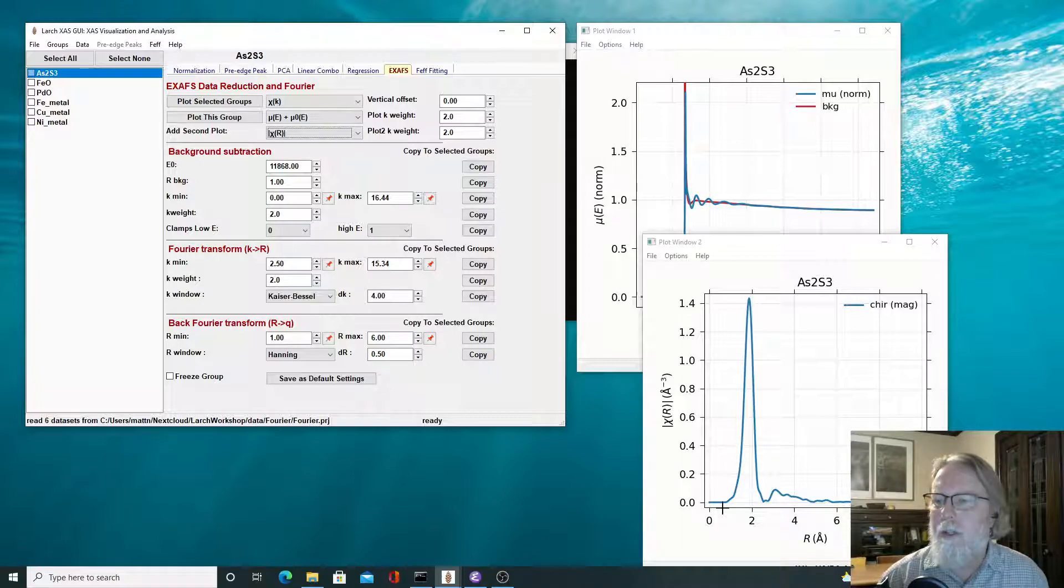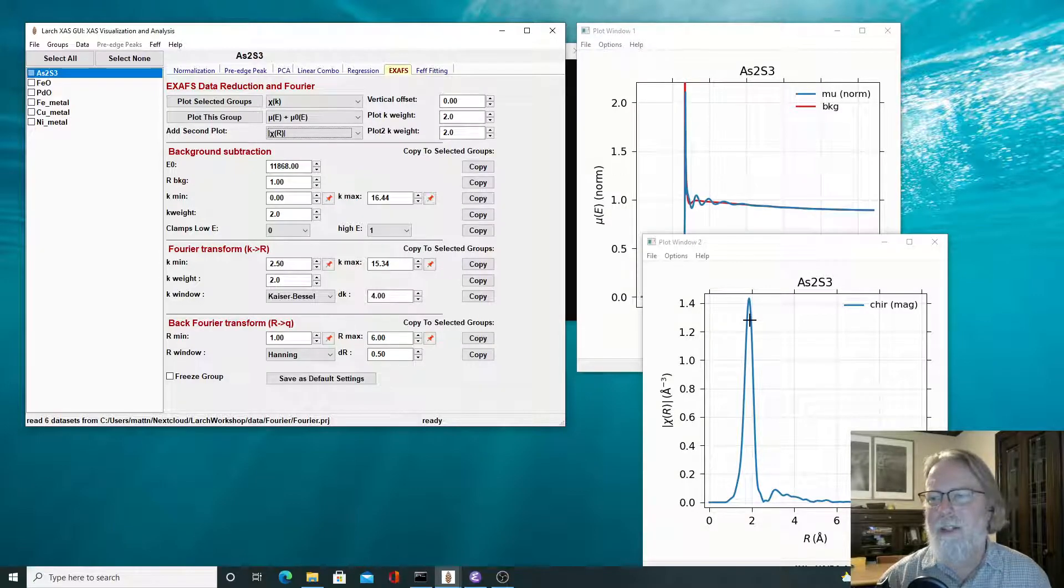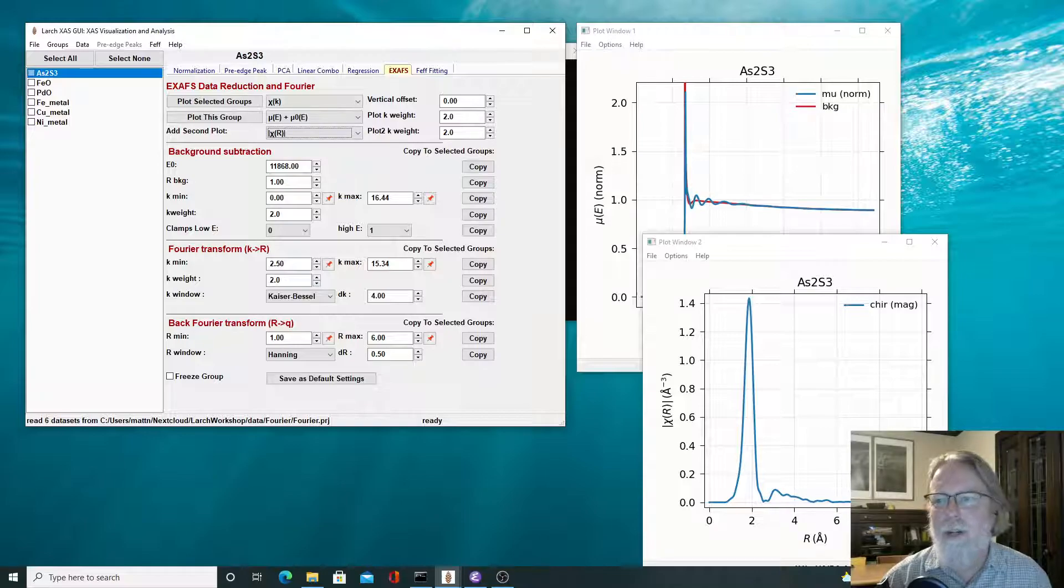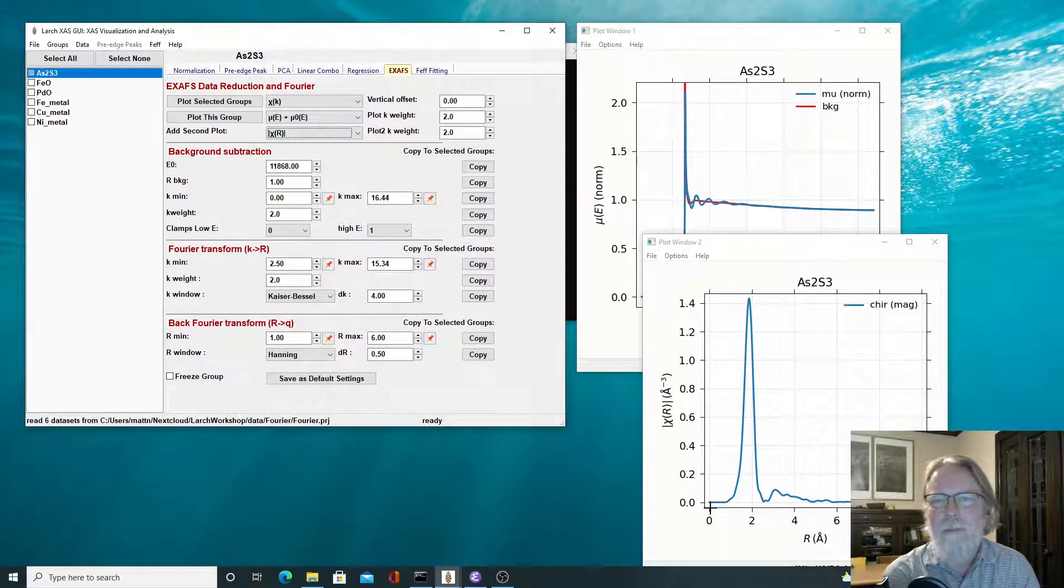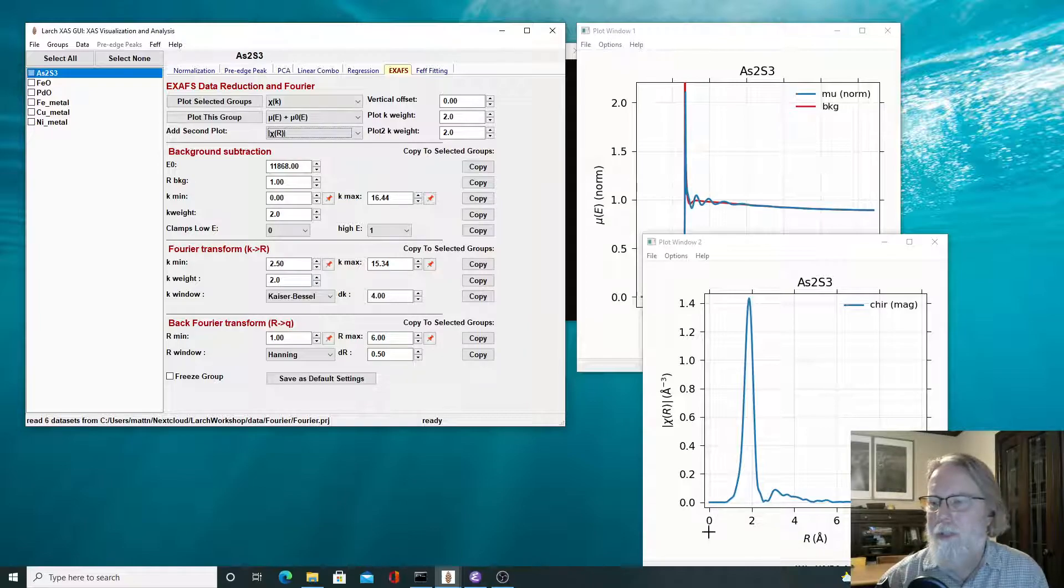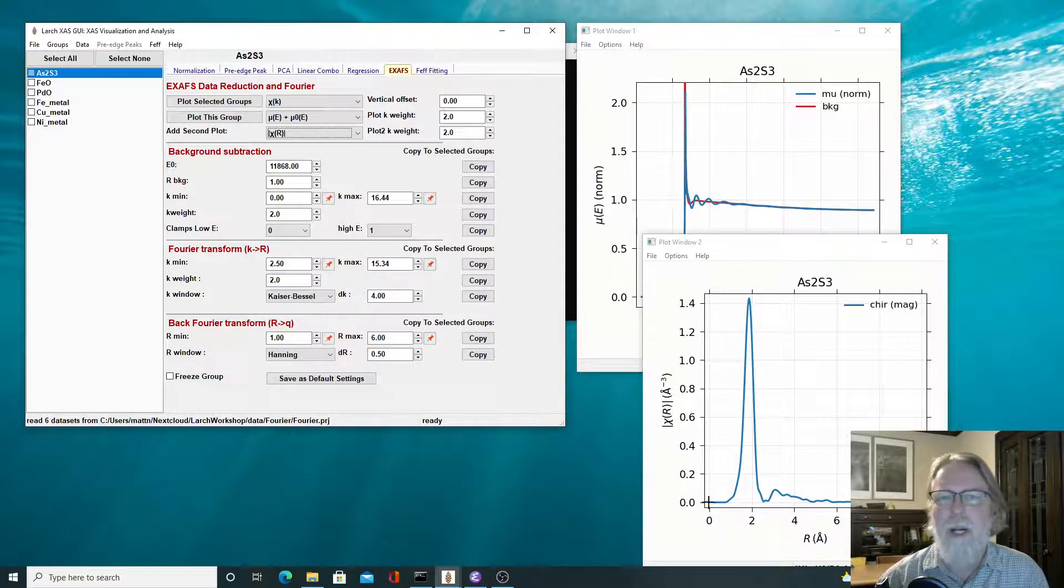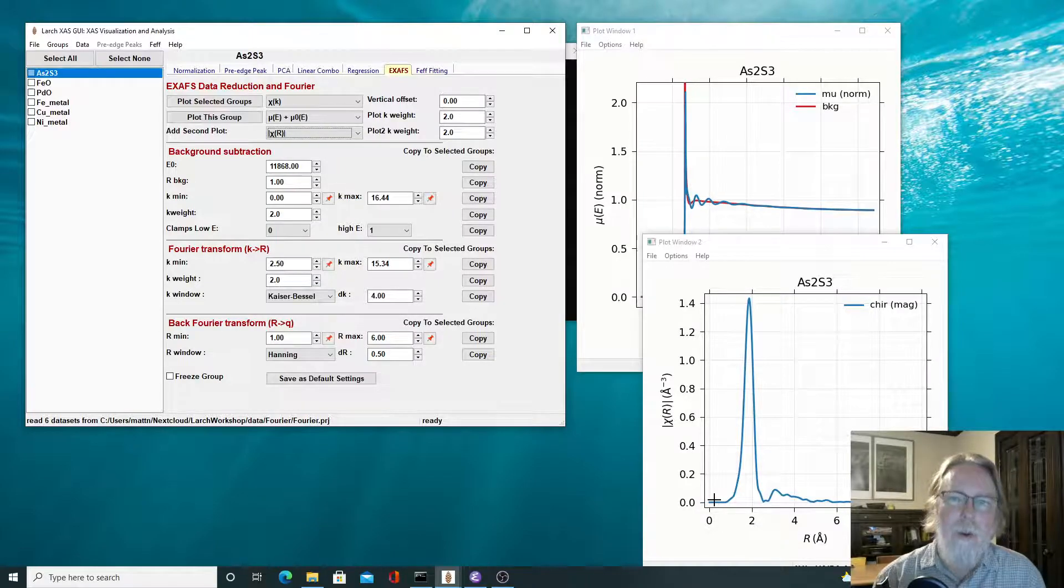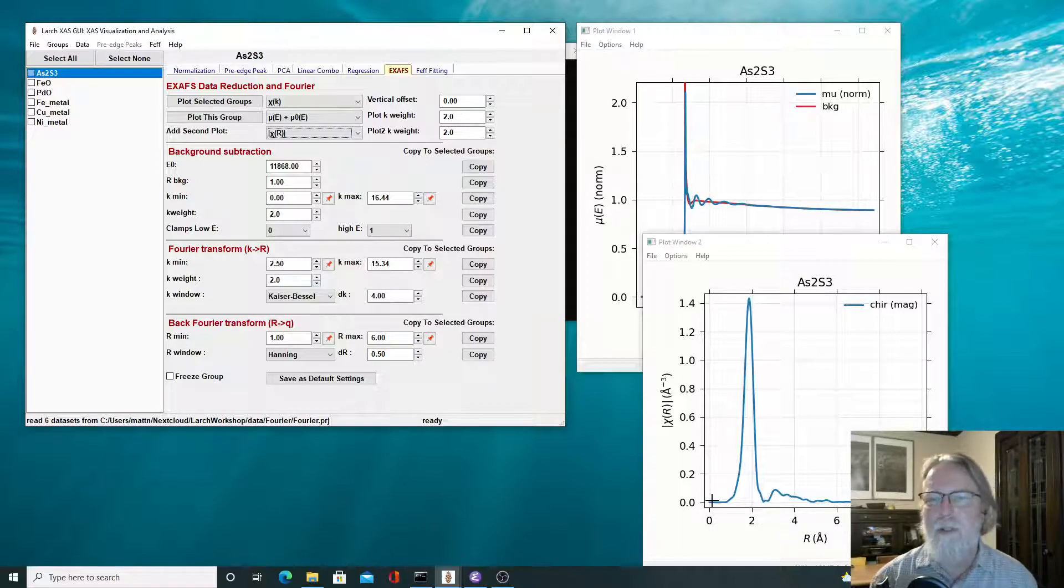But you can see that there's a peak at around here, around two angstroms, probably indicating that there's a distance, an atom, a sulfur atom at a distance of about two and a half angstroms. And then, but not much variation or not much oscillation at higher, at R values higher than six and actually nothing at zero. And if you can think about Fourier transforms again, the portion that R equals zero is the lowest frequency component. So that's the slowly varying part.